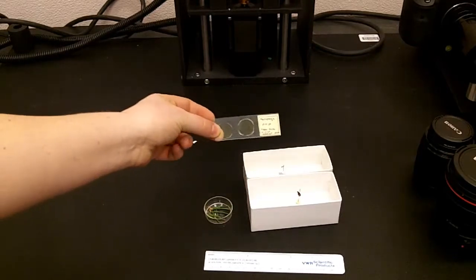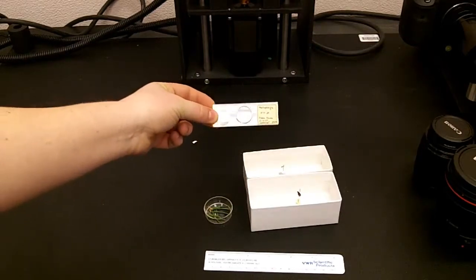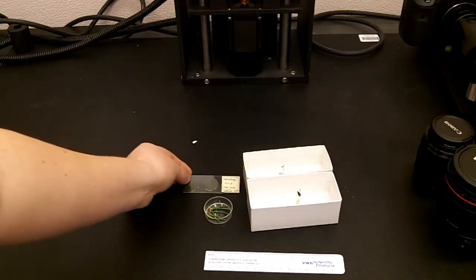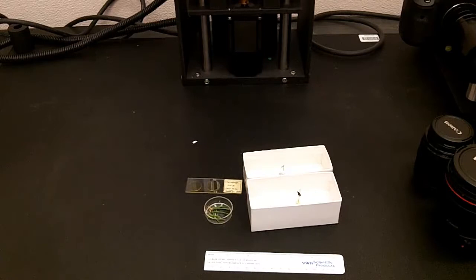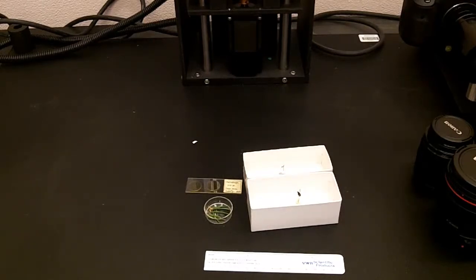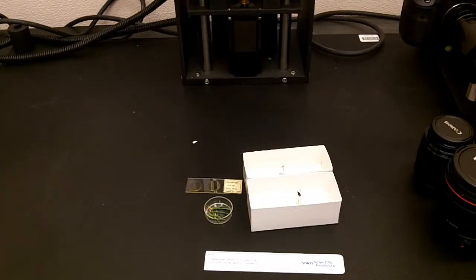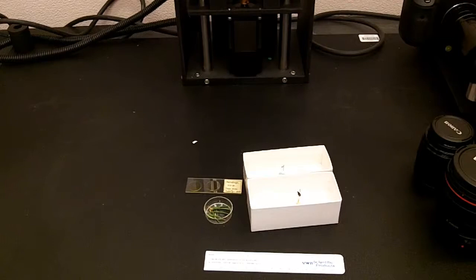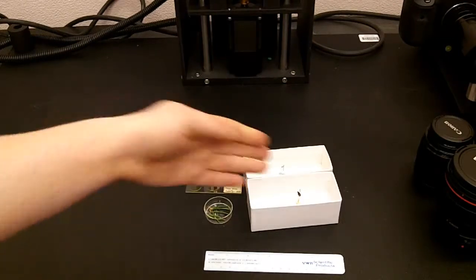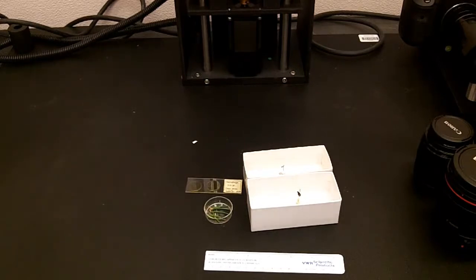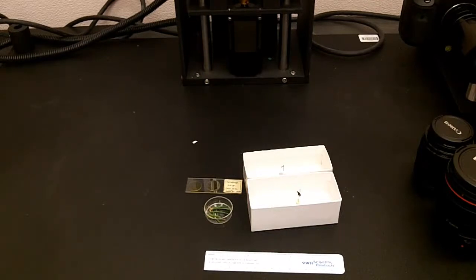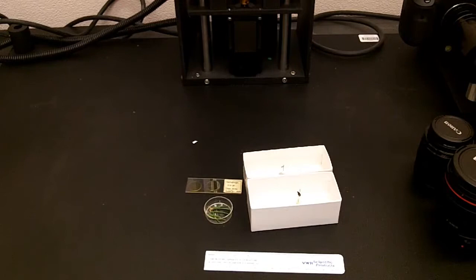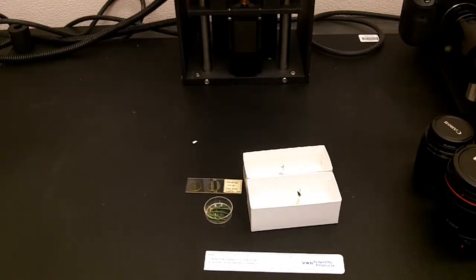And then here is a microscope slide that you can either use the 65mm or the K2 microscope. So, you may ask yourself, the K2 microscope and the 65mm can both image specimens of similar sizes, but why would you use one versus the other? Well, for all of these specimens, you could use the K2 microscope and you would get it would take slightly less slices to get the entire specimen in focus. But the quality of the K2 is a little less than the 65mm.